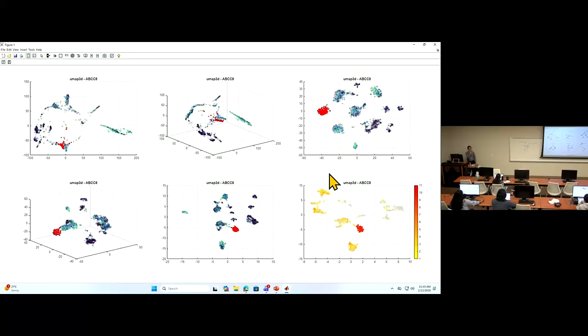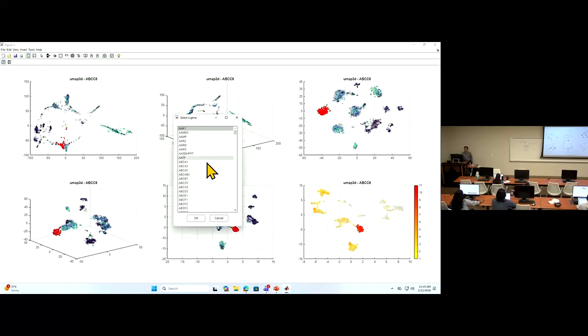So once you do this many times, try different genes. Most importantly, those genes you think are important in your system. Then you will have a quick idea about this cluster, what they are, what the cells are supposed to be, and so you start to have an idea about your cell type. So that's the way to look at the genes.